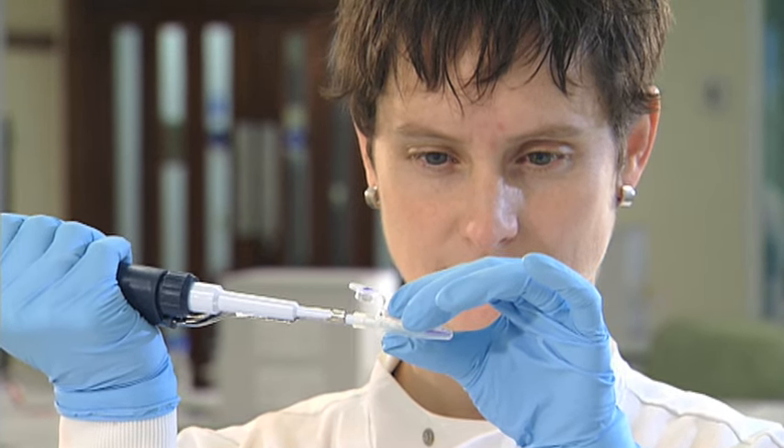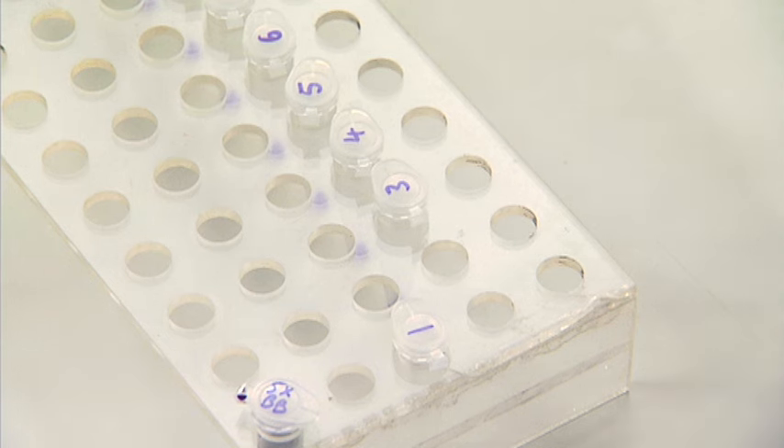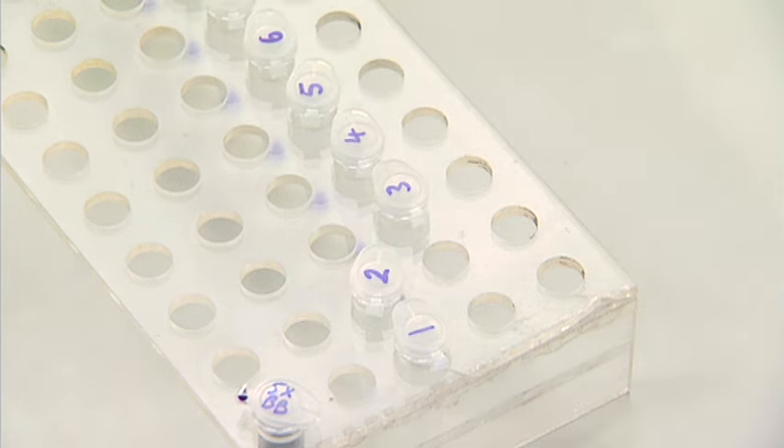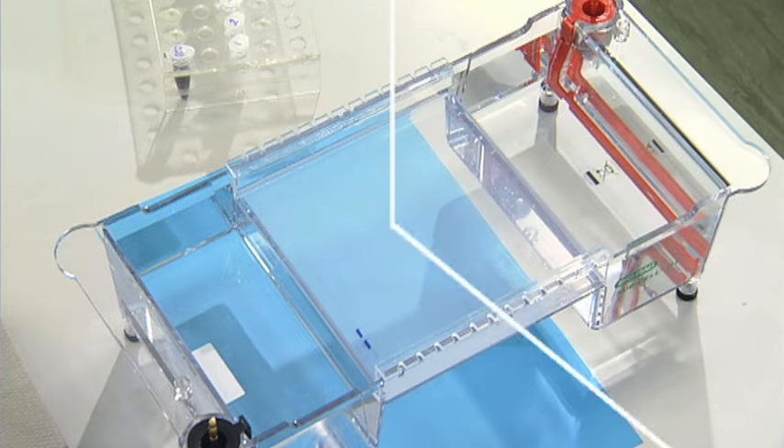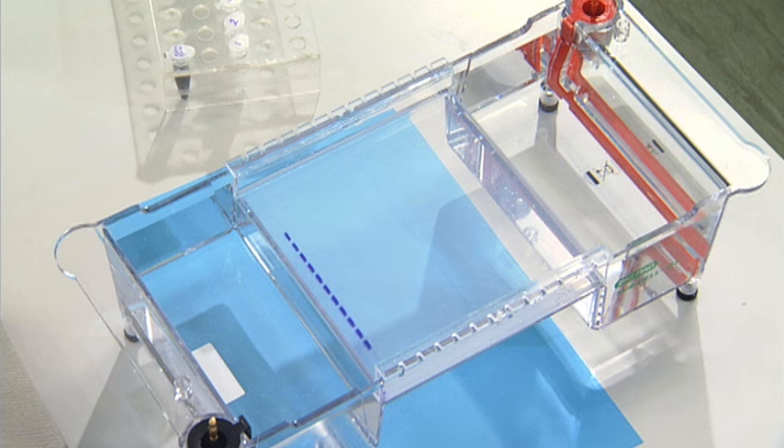When you've taken up a sample, move the tube it came from so you can keep track of where you are. Load the sample into the next well. When you've finished loading the samples, don't move the gel tank — this could knock the samples out of the well, causing sample contamination.